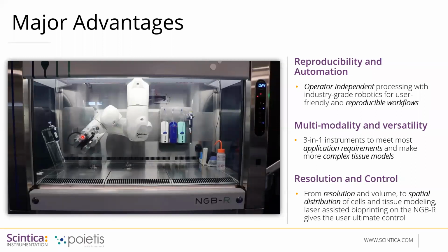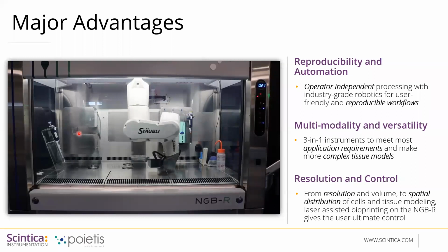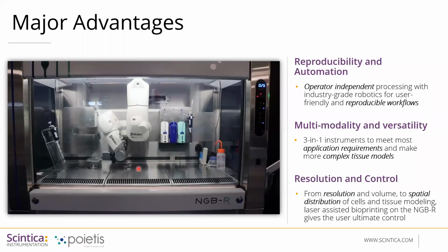On the side here where we see the instrument right now is actually an integrated microscope, and that's going to take a picture at whatever steps you program to allow you to see at a microscopic level what's going on with the cells and the materials that are being printed. There is a shield, it's a glass shield with a film on it to prevent any laser light from escaping from the system, and there's an interlock to ensure the safety of the operators there.